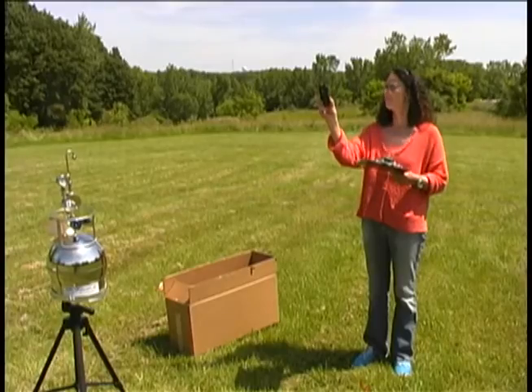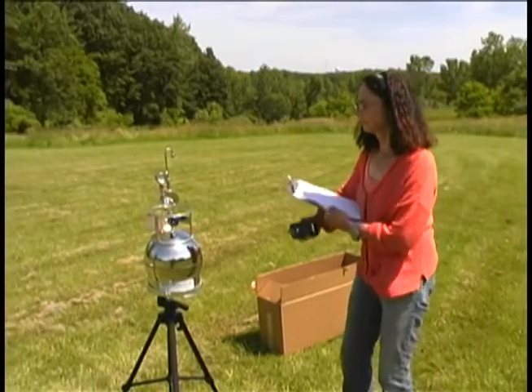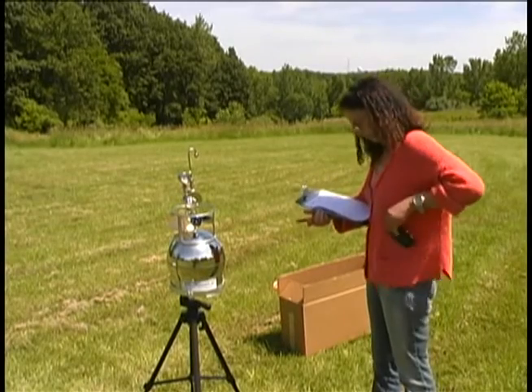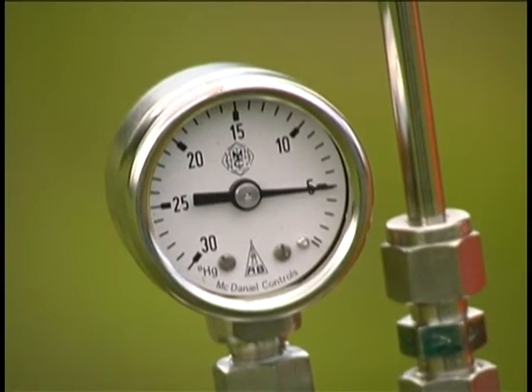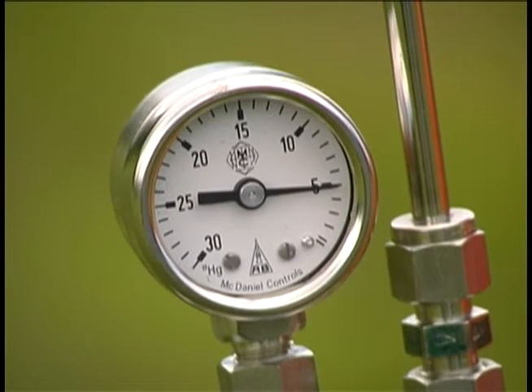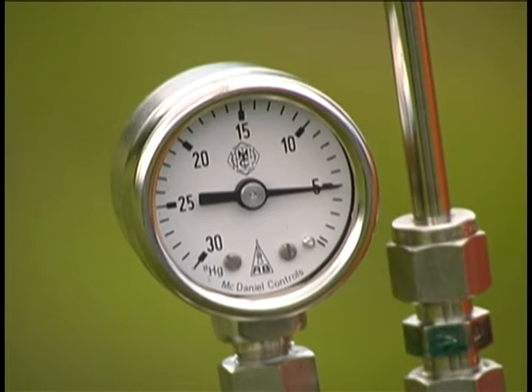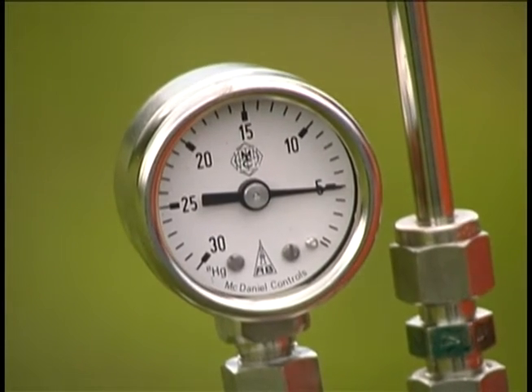One hour has passed and our sample has been collected. Step seven: record the pressure from the gauge. Close the canister valve by turning the canister valve clockwise. Do not over tighten the valve knob. Step eight: record the stop time.